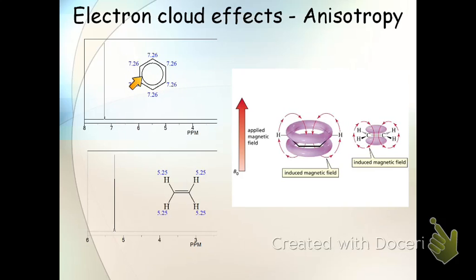So what do we see? Well, if this was really a methine group, you'd expect to see it around 1.7. It's a CH at this structure, because remember I didn't draw those hydrogens. So if it's really around a 1.7, and that's where you expect to find it, you'll notice that it's all the way out here, between 7 and 8.